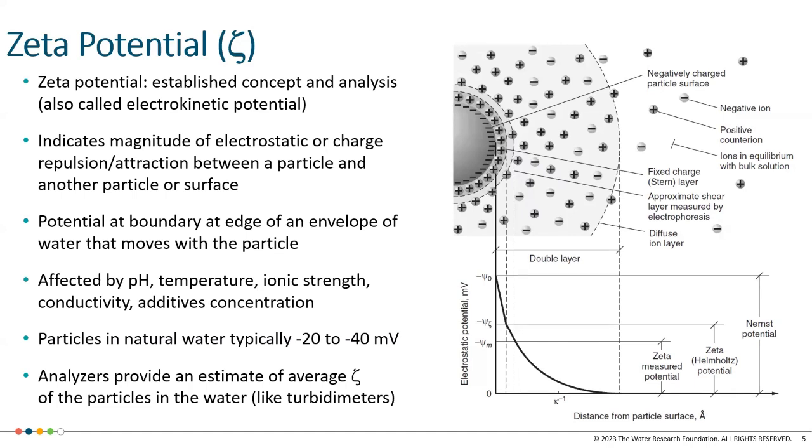And that's why it's sometimes also known as the electrokinetic potential, with electro indicating the electric field and kinetic referring to movement. So I've included this figure on the right. I know it's busy, but it emphasizes that zeta potential values reflect measurements made by electrophoresis, as is indicated here, and that those measurements are used to approximate potential at the shear plane.